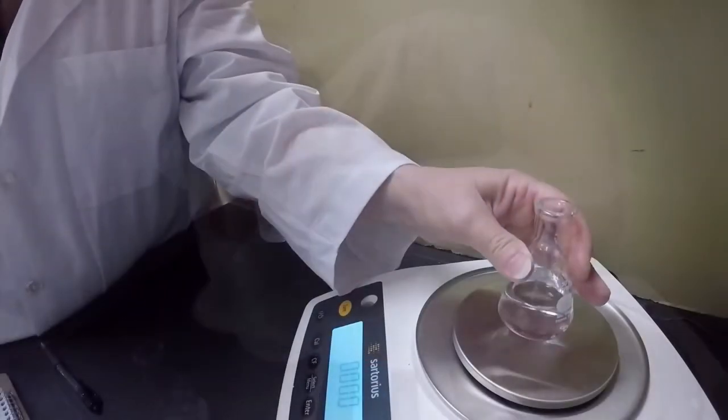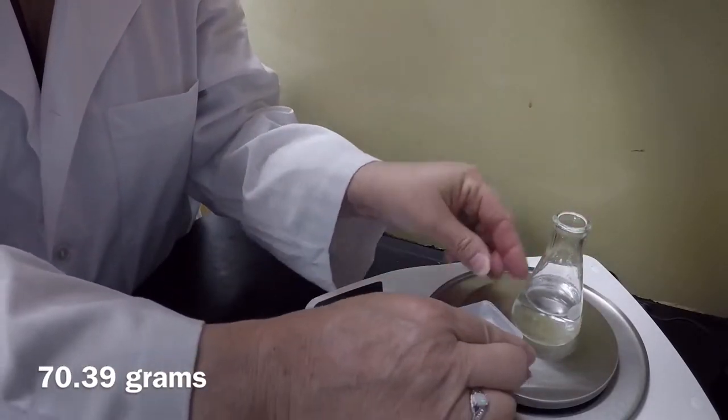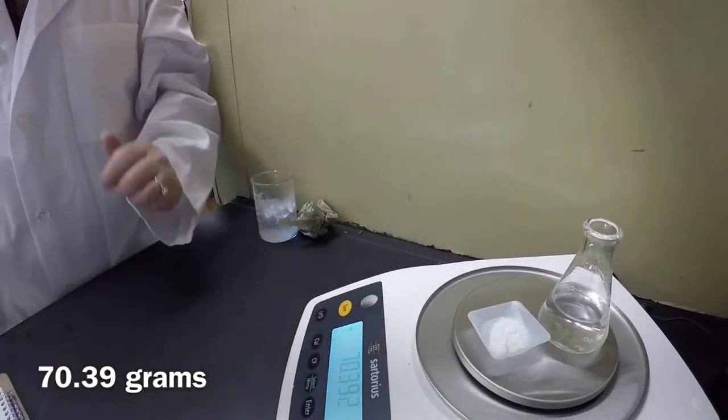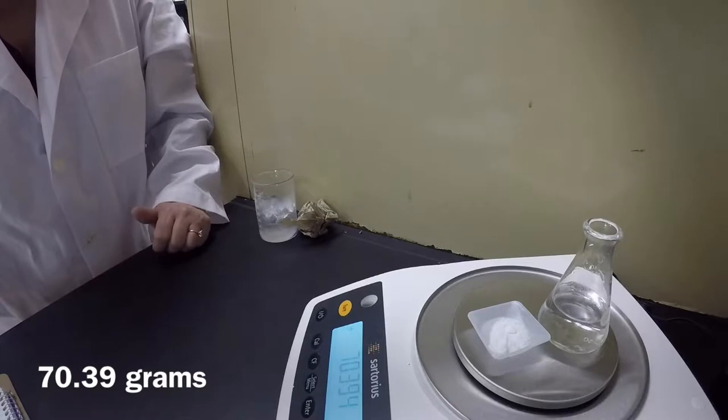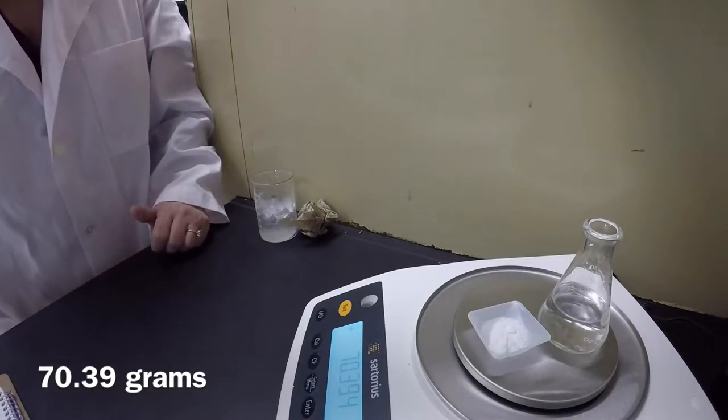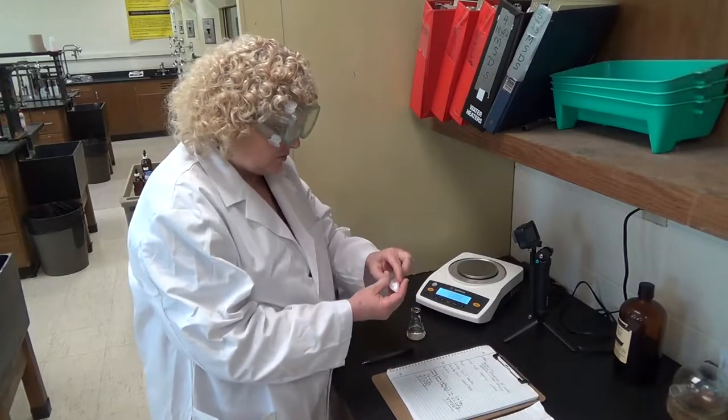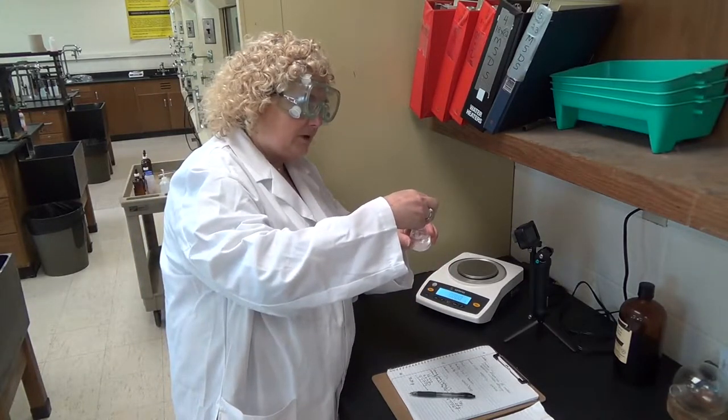I need to weigh both the glucose crystals and my water. And so we can see here that we have 70.39 grams of glucose crystals and water. I'm going to take this glucose crystals, and I'm folding my weighing boat so I don't lose any of it. Allow this to drop down in here.